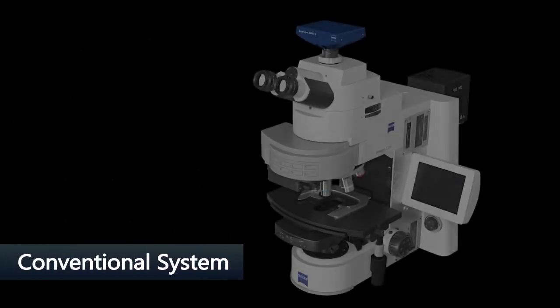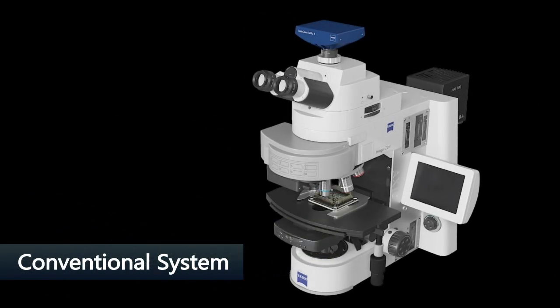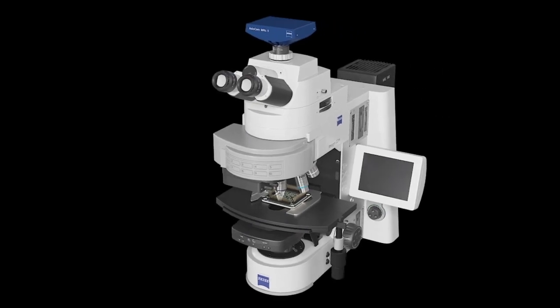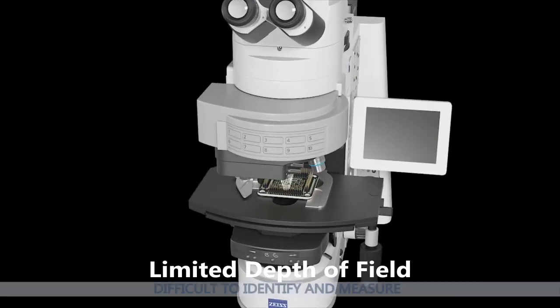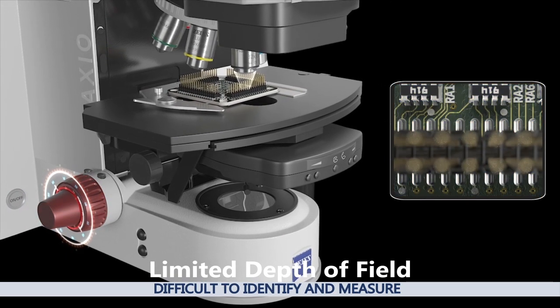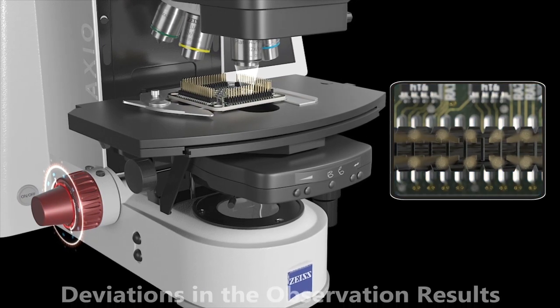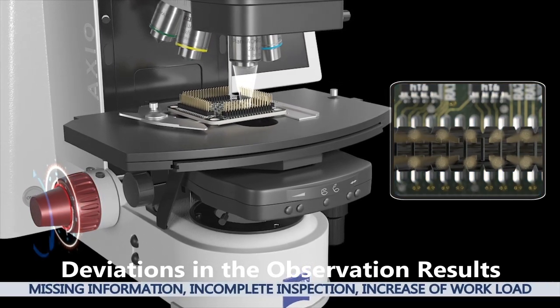The conventional system has a limited depth of field, so a user has to adjust the focus manually by moving the z-axis. It is difficult to identify the exact shape of the object instantly. The manual movements can cause deviations in the observation, missing information, incomplete inspection, and an increase in user workload.